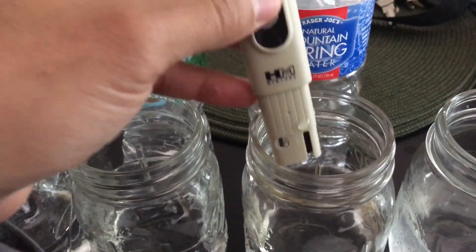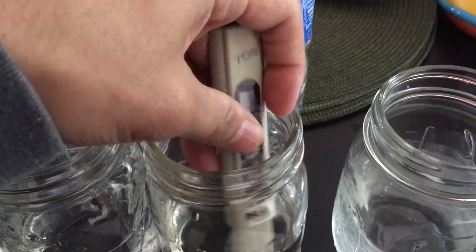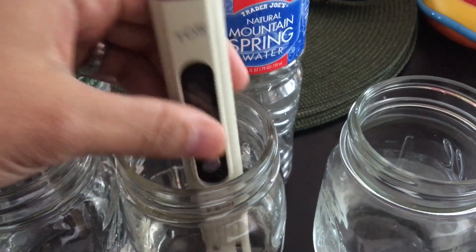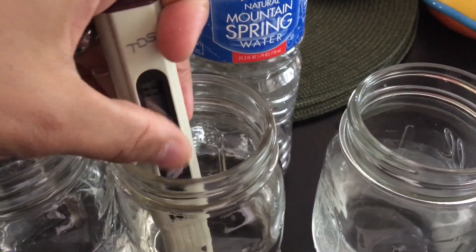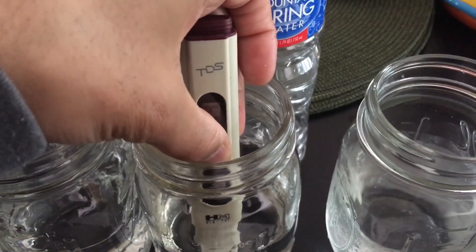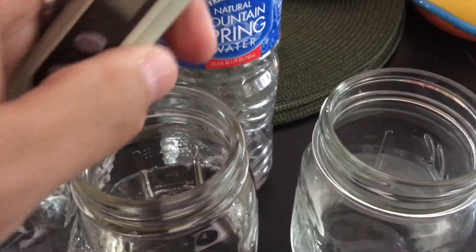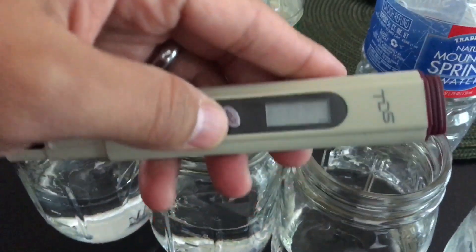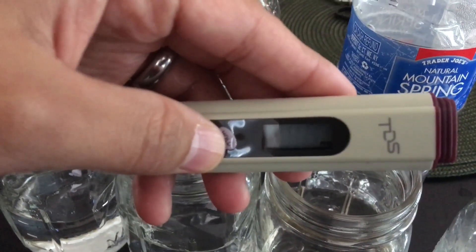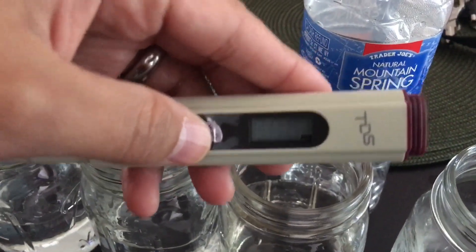Now let's try the Trader Joe's Natural Mountain Spring water — you'd think this stuff would be pretty good. Let's see how it compares to Poland Spring. We leave it in there a couple of good seconds until it stops fluctuating. From 163 for municipal water and 20 for Poland Spring, the Trader Joe's comes in at 105 parts per million. So although this water is relatively inexpensive, you can see the quality is not as great as Poland Spring.